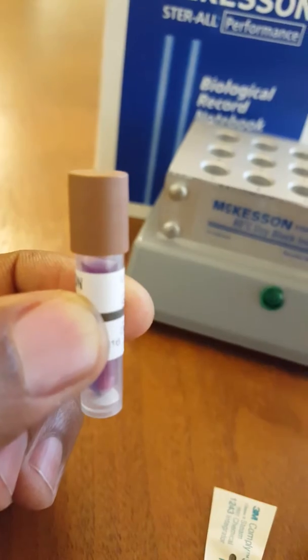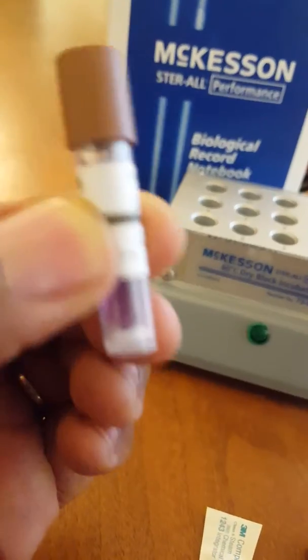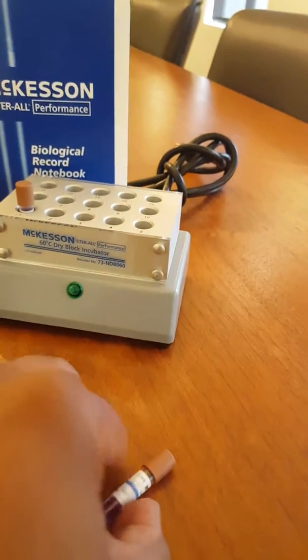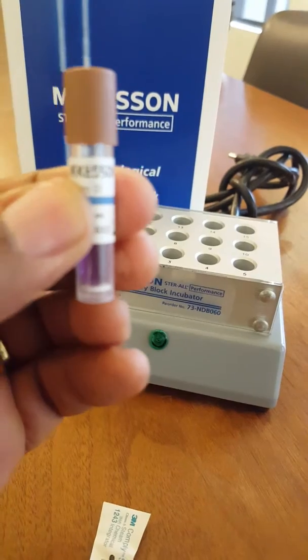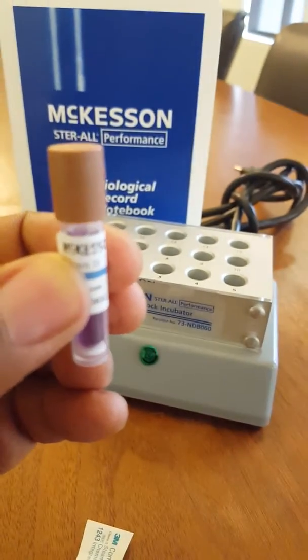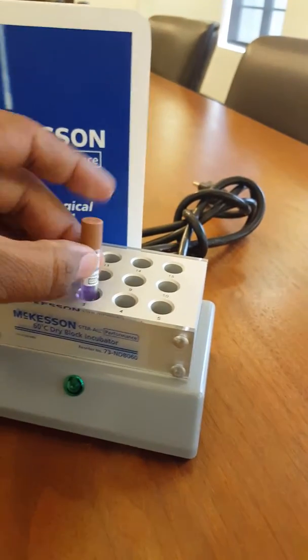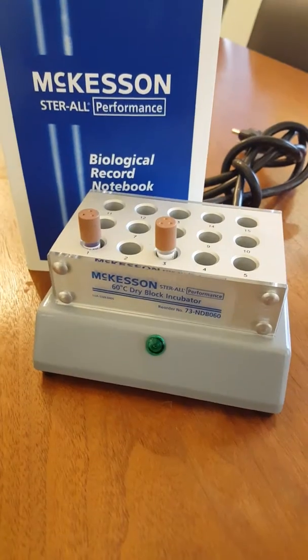To confirm that it did kill those spores, after crushing the ampule and the purple medium gets onto the spores, we're going to place it inside of the incubator. And then we're going to take the control, which is the one that was not autoclaved. We're going to crush the ampule as well. And of course, it's going to mix in with the spore pad there to try to grow some spores for us to confirm if there are spores adequately inside of this or not. Once it's placed in here, we're going to let it sit for 24 hours.